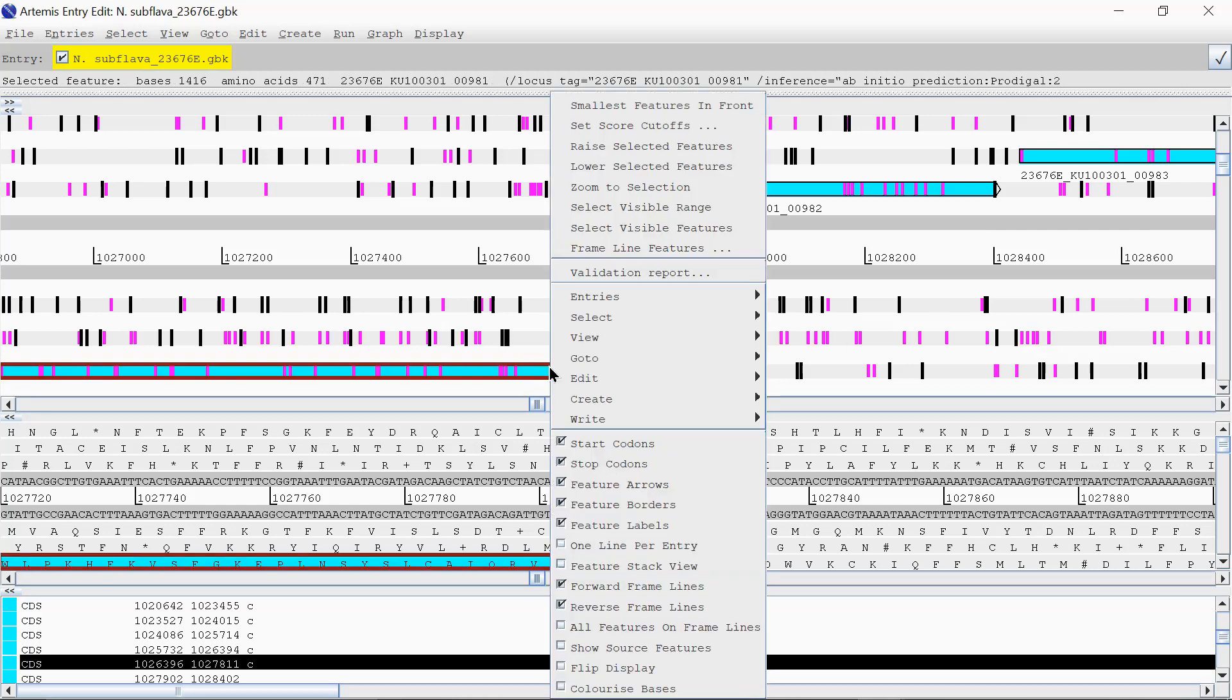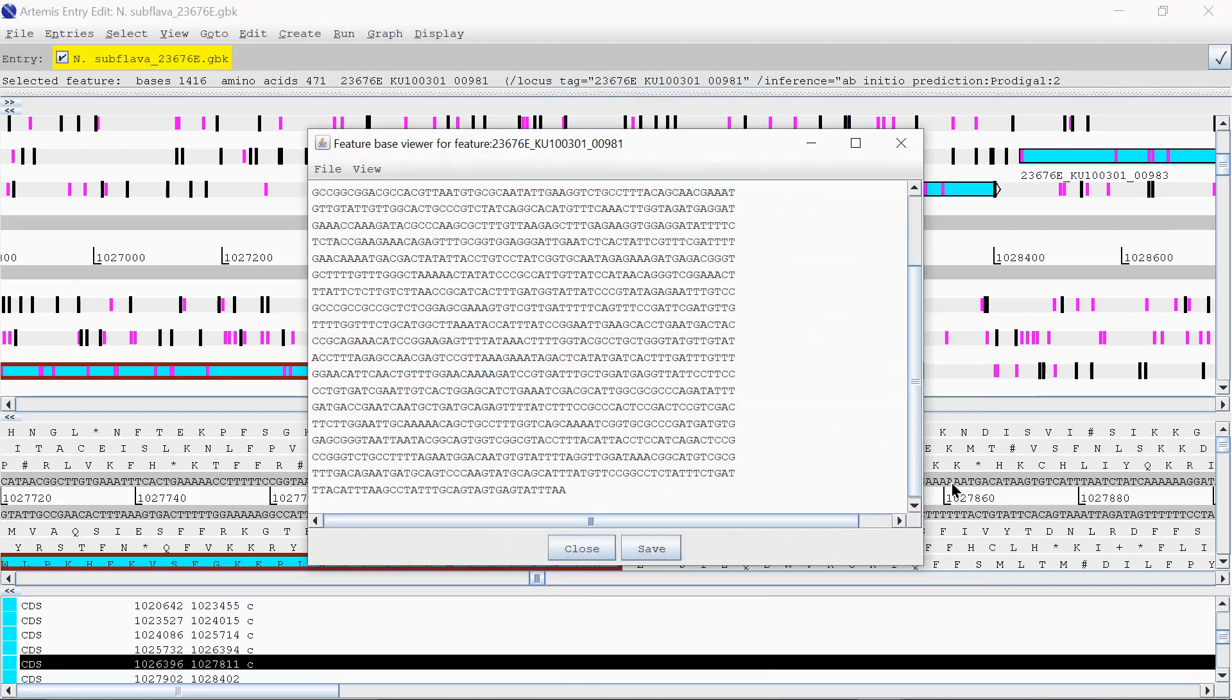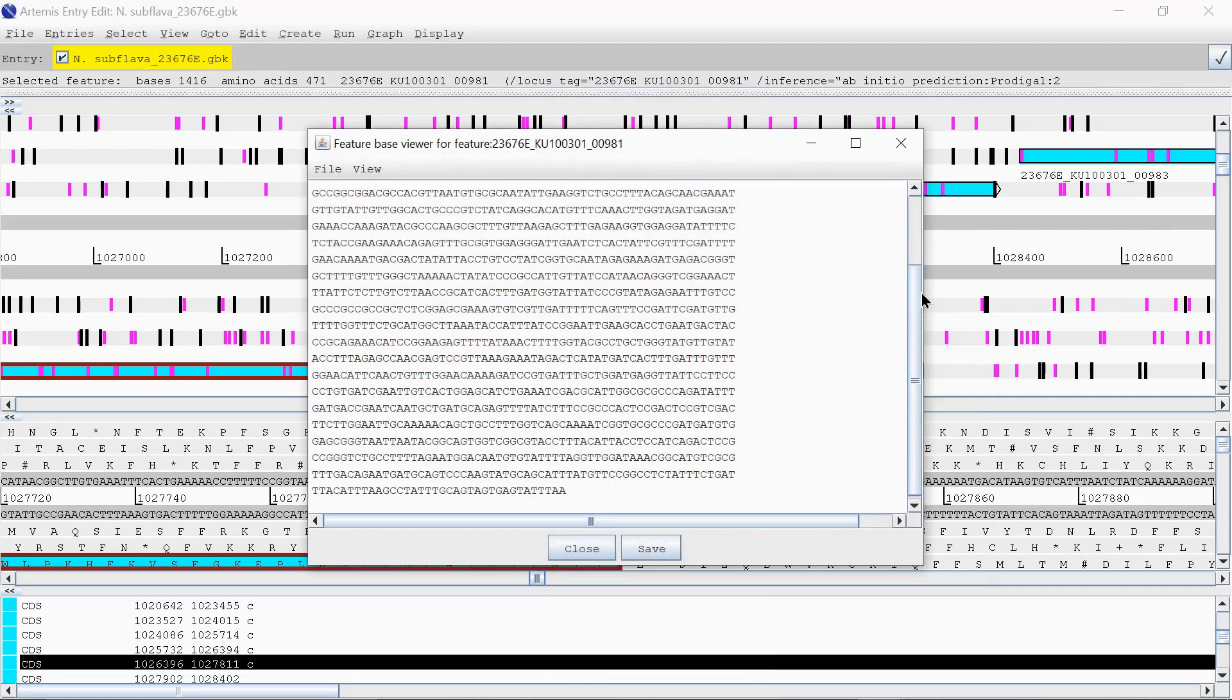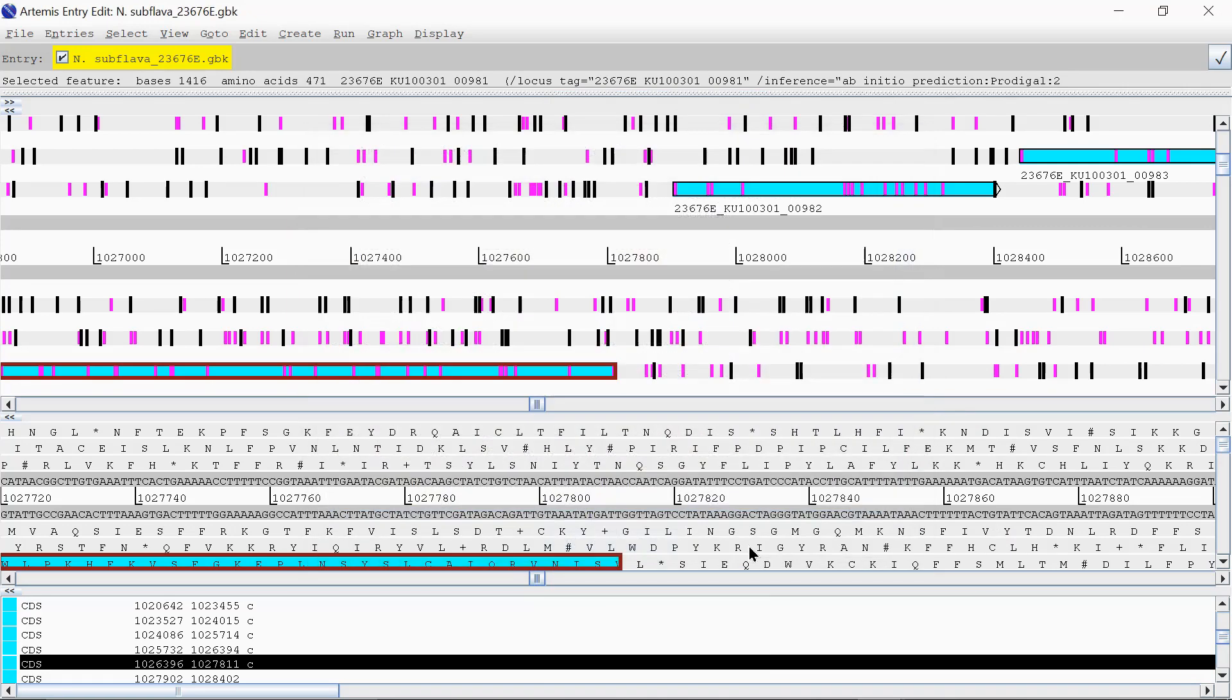But if you right-click on here, you can view, select bases, bases of selection are faster. This will just then bring up your sequence here. So that's just to get Artemis up and running.